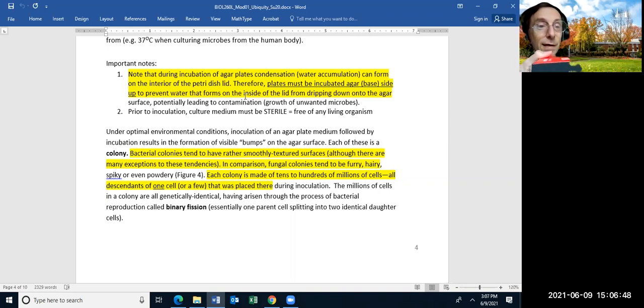There it's partly showing up. And that way, when the moisture comes out of the agar, it will condense on the top, which is where the agar is, and then the agar will absorb the moisture throughout it, and so a drop will not form. And even if a drop were to occur and drop on the lid, we say, so what? You have no bacteria on the lid.